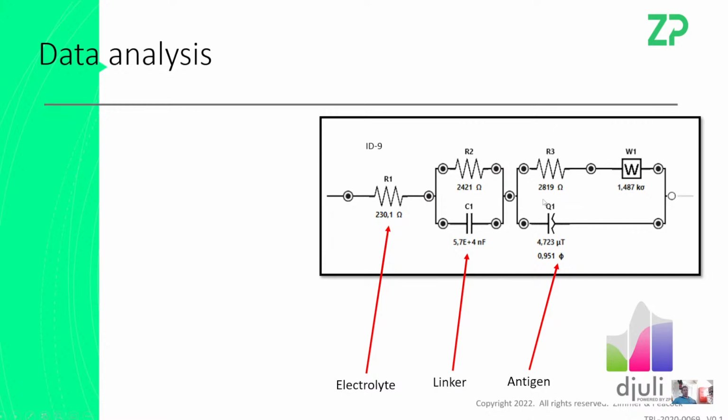But if you had a more complicated equivalent circuit, you might be able to separate those two elements out a little bit. So it is hard, obviously, to just receive an inquiry in text and then translate it into the AHA solution. But I would take a look at supply of electrodes. I would take a look at trying carbon if you're on gold, or gold if you're on carbon, and I would actually think about a more complicated equivalent circuit. Clearly, your one is not explaining the phenomena that you're seeing. And as I say, this is actually one of the equivalent circuits that we've used in order to understand our data on occasions as well.